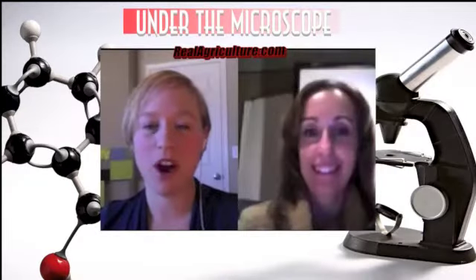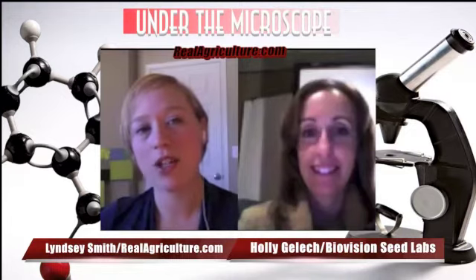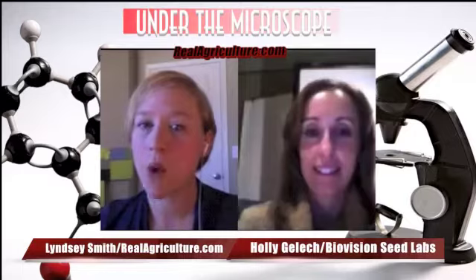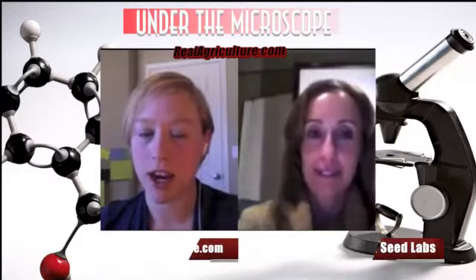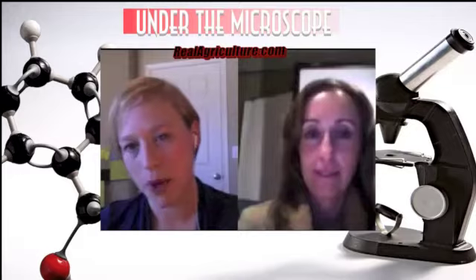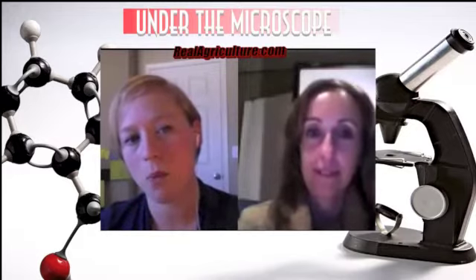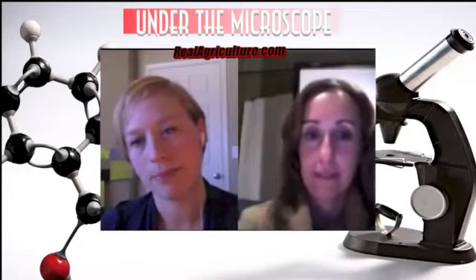Okay, so we are here with Holly Gelech, Business Development Manager with BioVision, and we are talking about the seed test specifically for pulses and the role that the information you get plays in establishing that crop and getting that optimum plant stand. So, as a first step, when farmers are sending in their pulse samples, what information should they be asking for, and then what do they do with it?